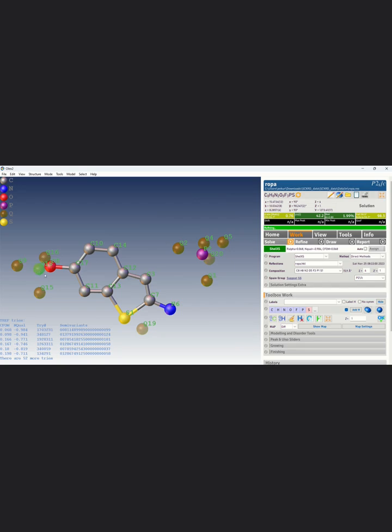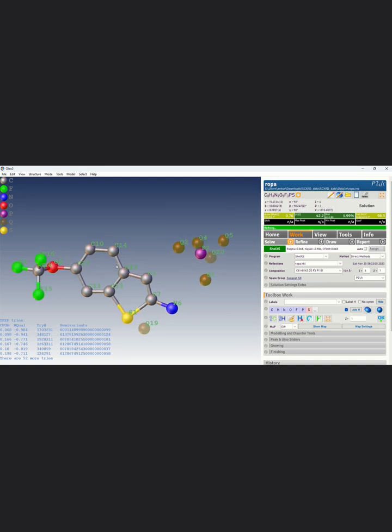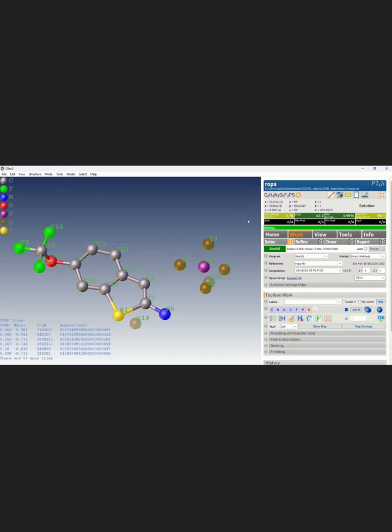So I can assign this as carbon, and these 3 are the fluorine atoms. I can make them fluorine. Now you can see that this carbon has tetrahedral valency, 4 bonds, and this oxygen is also forming 2 bonds, so this is also fine. Now this phosphorus might make 5 bonds, so this might be covered with oxygen.